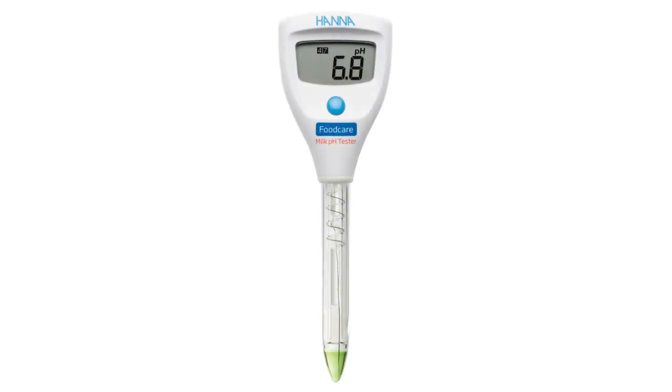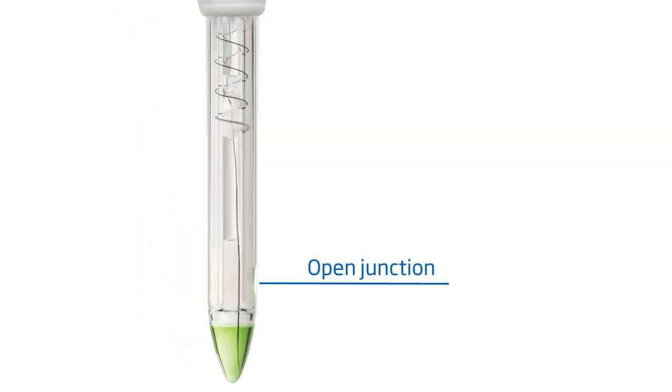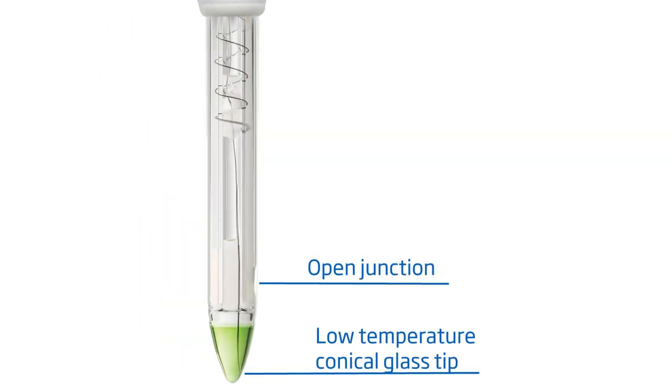Designed to bring simplicity to pH testing during milk processing, the HI981034 milk pH tester is engineered to withstand the tough environment of milk processing plants. The built-in probe features an open junction and a low-temperature conical glass tip.